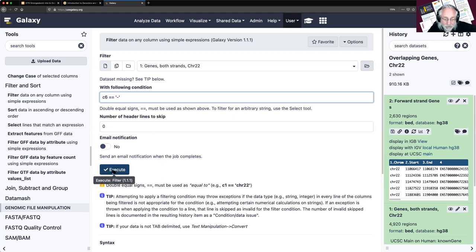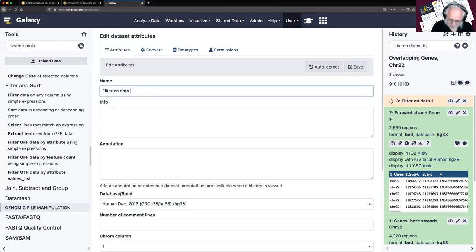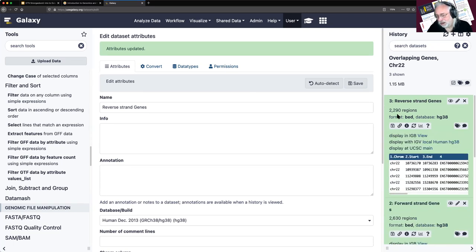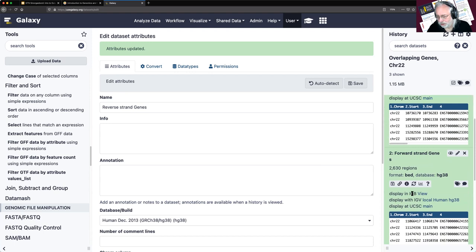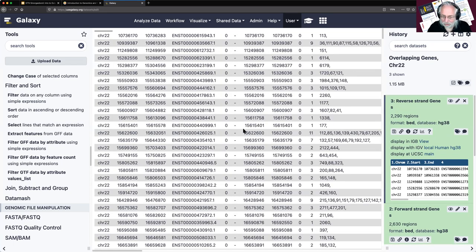I execute and rename the result 'Reverse Strand Genes.' Expectations game: we got a little more than half on the forward, so we should get a little less than half on the reverse — maybe 2,300. And yes, we got 2,290. So 2,290 reverse and 2,630 forward. This all looks good and passes the plausibility test. We poke it and yes, they're all minuses.